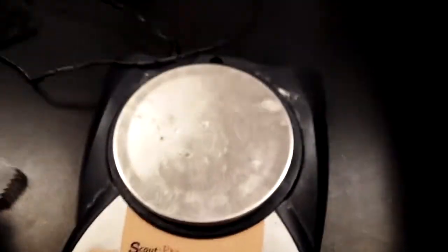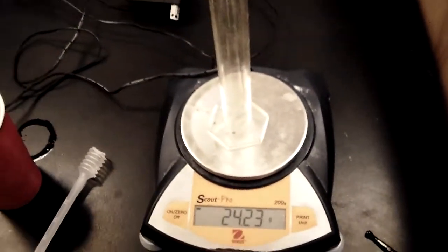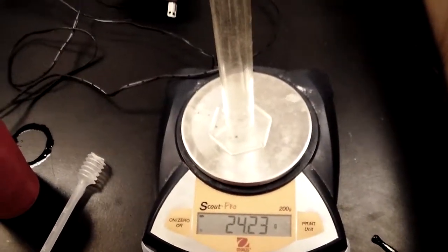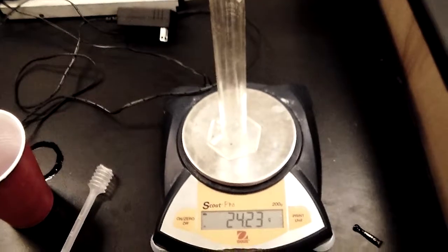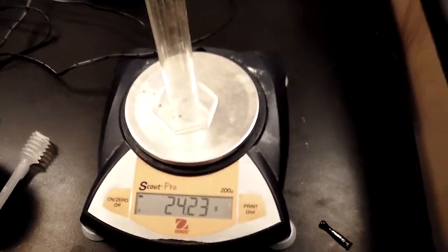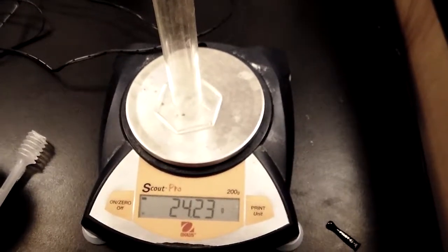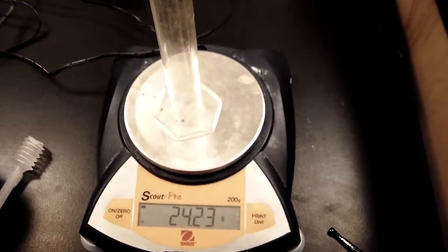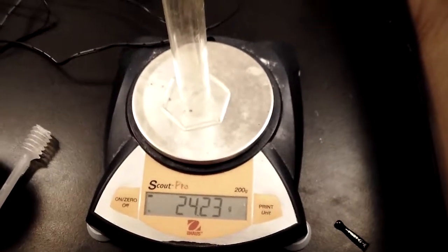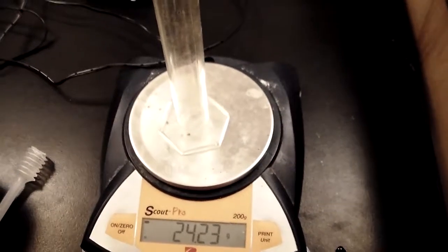Here's our graduated cylinder — 24.23 grams. That's how much it weighs. Now we're going to switch over because I have another video on how to read a meniscus. Catch you on the flip side.